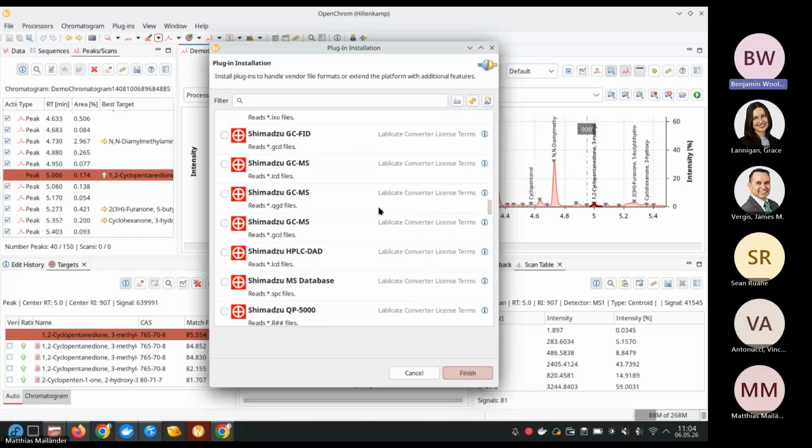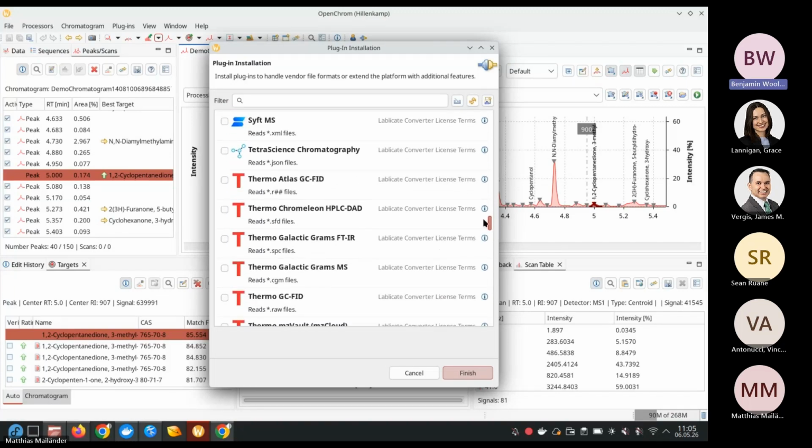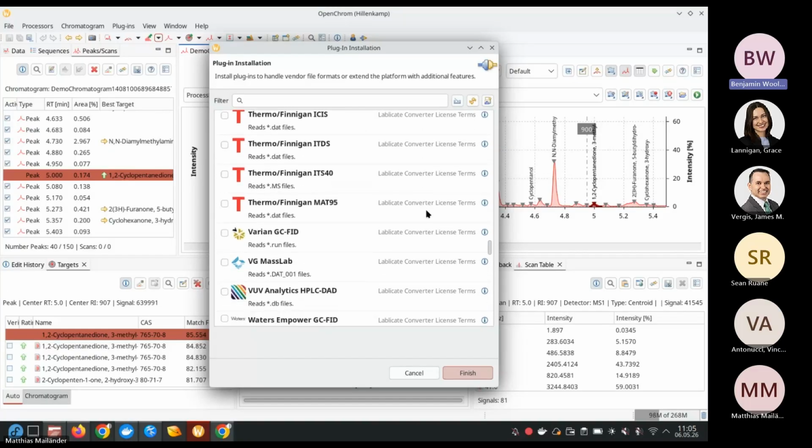We don't usually write a change log about these converters, but they're constantly improved. For example, the Shimadzu LabSolutions for GC and LC were recently released. And there's also something coming up from TopWorks. They have an HDF5 container, and they gave us their full specification, including all the mathematics to calculate the results. So that is another way to make converter development go from months to weeks. I'm just saying, hint, hint.